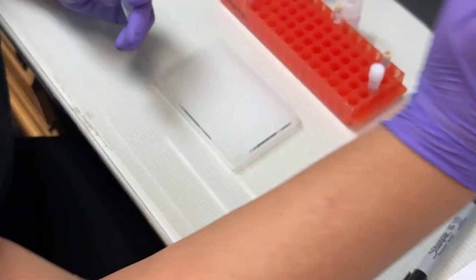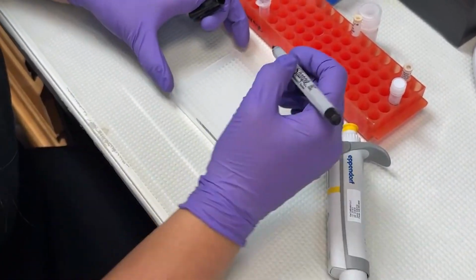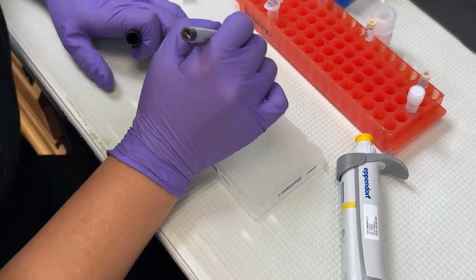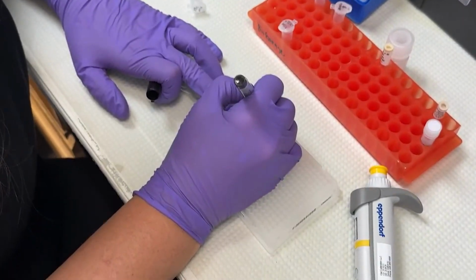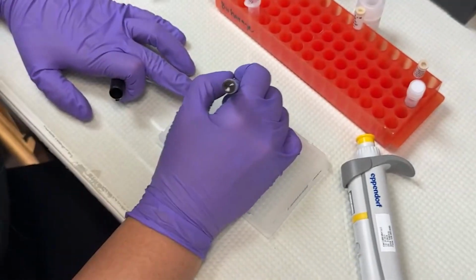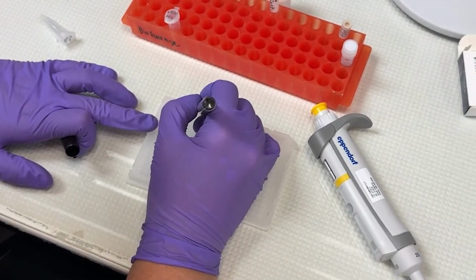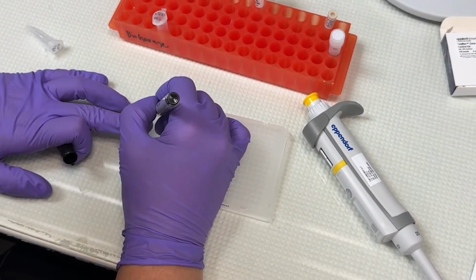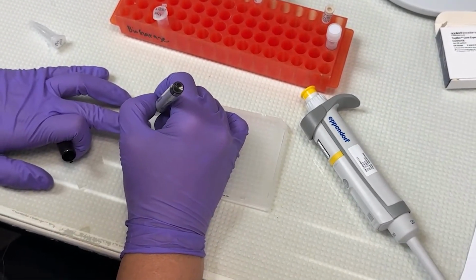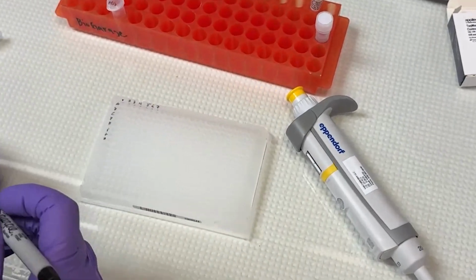So everybody's looking at white on white, and even I am having trouble seeing what's going on. So I'm going to make some marks so we can track ourselves. 1, 2, and 3, and then we will have 4, 5, 6, and 7, and then we have A, B, C, D, E, F, G, and H. That should be enough.